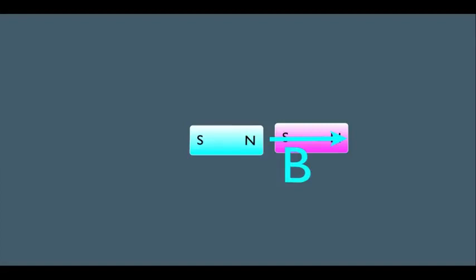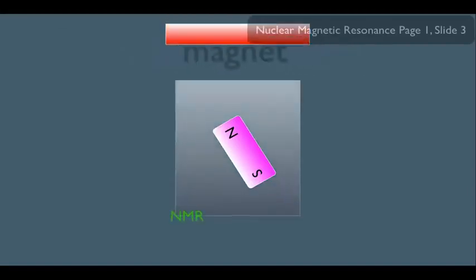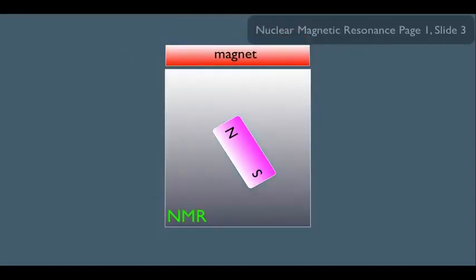So now let's talk about what happens when we stick these magnets in a machine such as the NMR. Let's say we're putting this in our NMR like this. Just think of the NMR as simply containing a chamber where a magnet or a sample can be inserted, and that chamber is being influenced by a big magnet here in red. Let's represent our magnet as our vector like this, expressing its orientation.